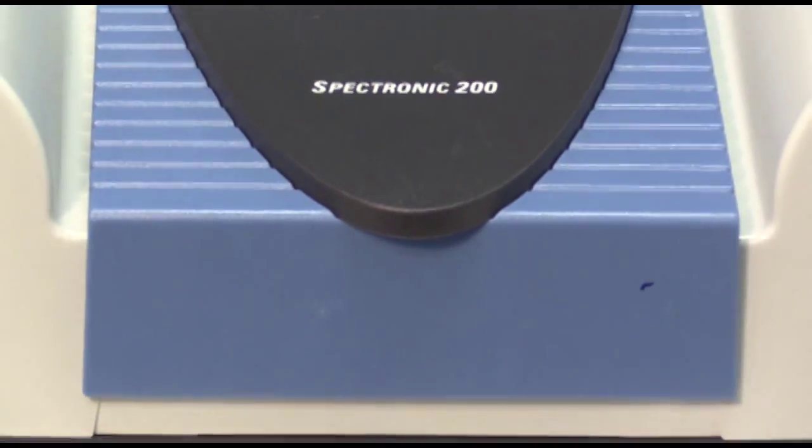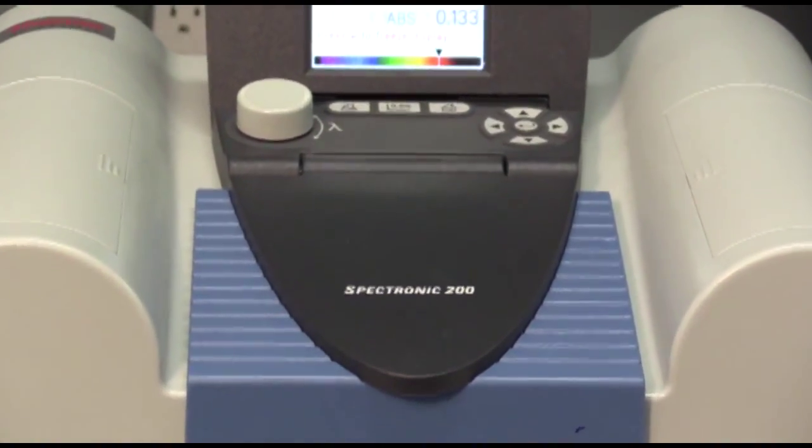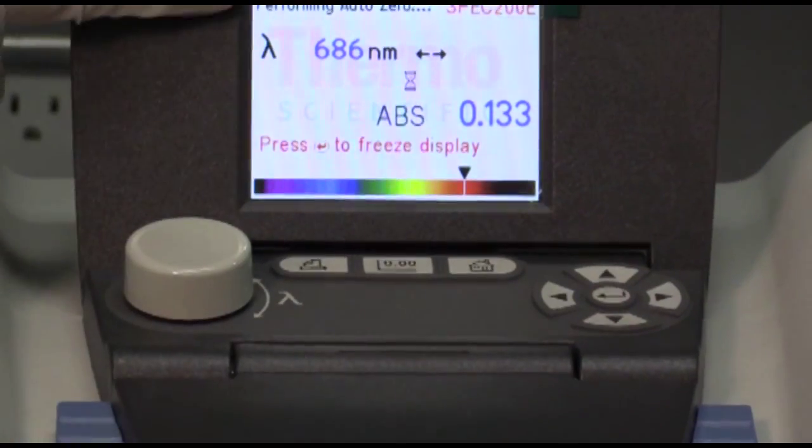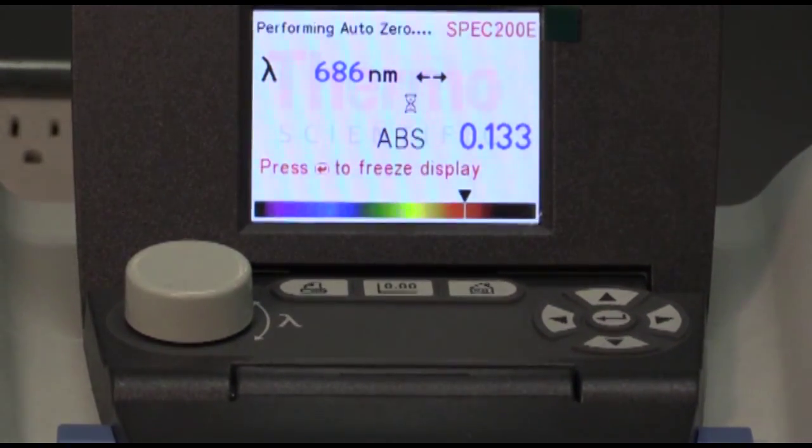This is our blank, so the first thing you want to do is to find the button that says 0.00, which is the blank button. Press it, and the instrument will now say performing auto zero. Wait at this point.